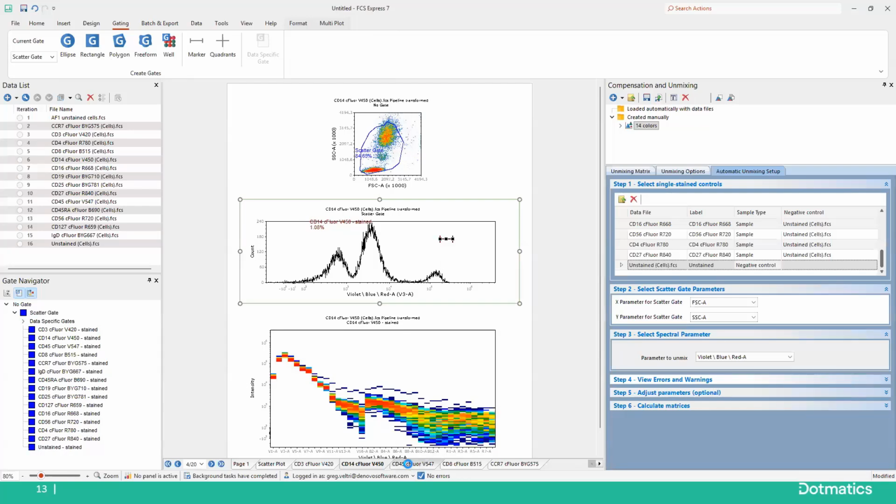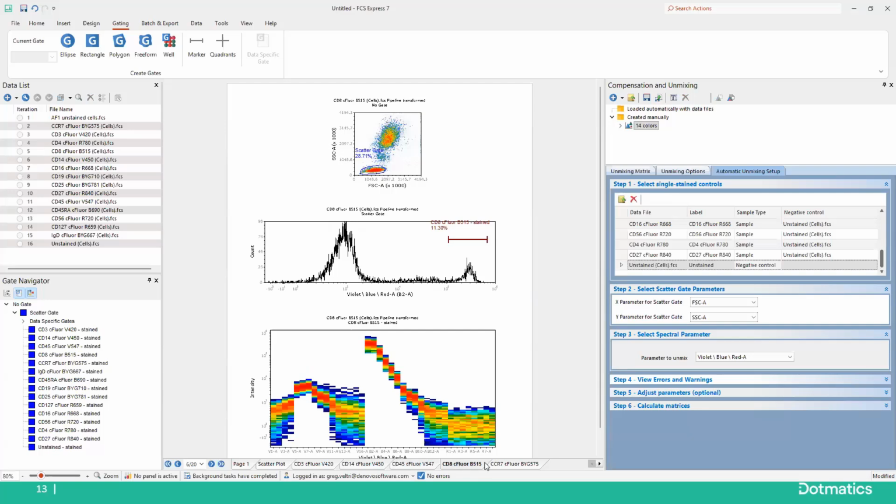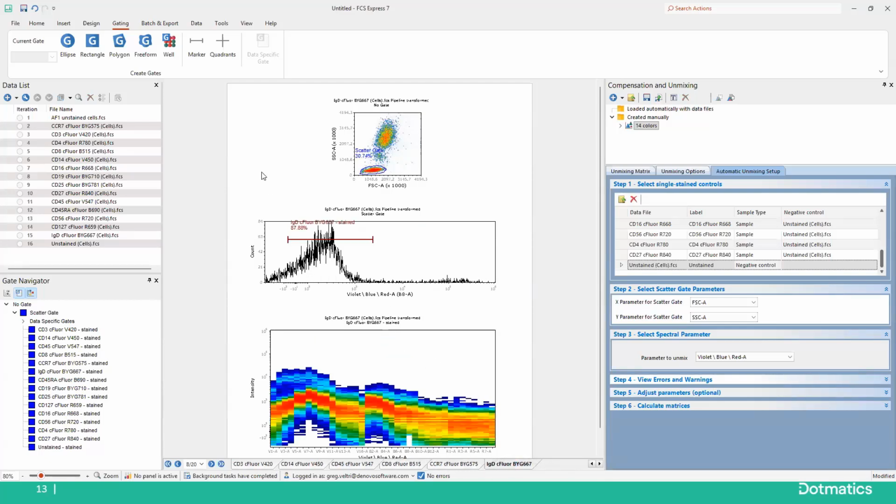All right. Then we'll go to CD45. That looks fine. CD8. We can change it if we wanted to, but it looks good for now. This looks good too. Let's just continue down the road. IgD. Okay, so not very bright, but we need to move this because it is sitting down over there. So let's move it there and select this and move this over here.